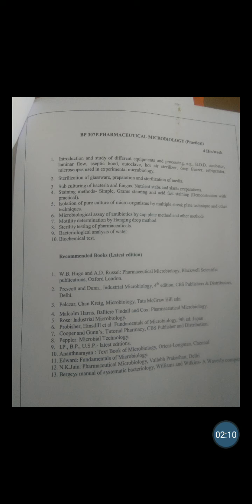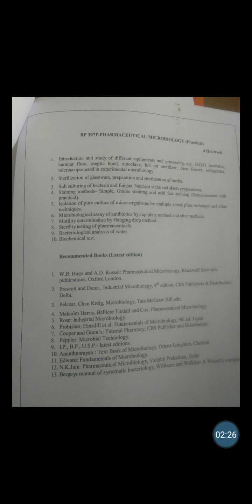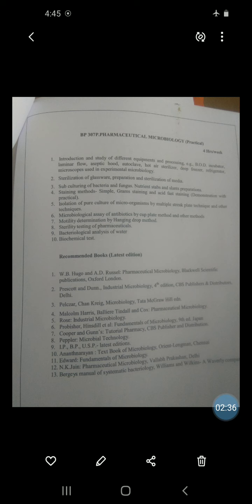Yes, the hanging drop method. We see the principle in this. The hanging drop method is the process of observing the motility of bacteria, and it is a wet mount method. The method is used in dark illumination, and it gives a very clarified view of microbial motility.